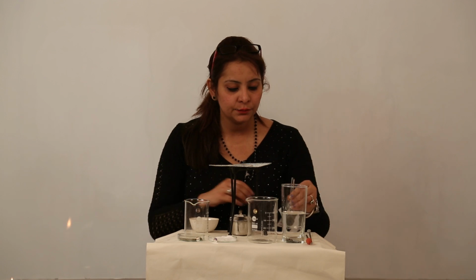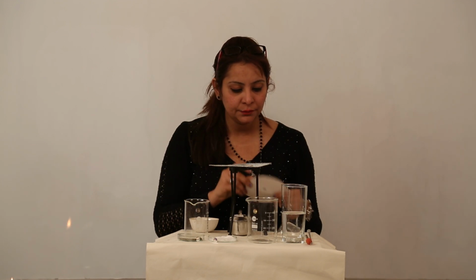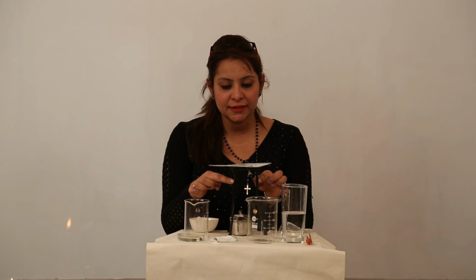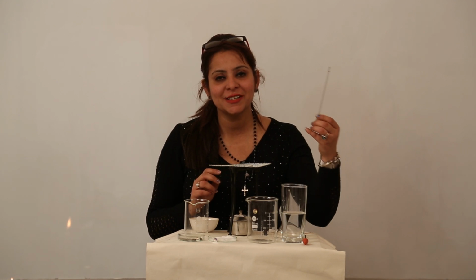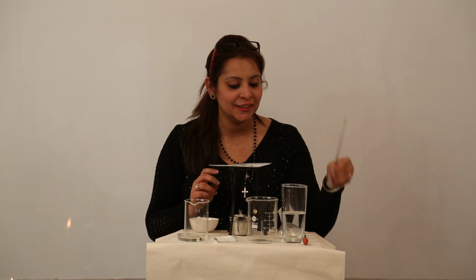This is the funnel, a filter paper, a tripod stand, a wire gauze and a burner. And of course a stirrer, how can I forget, because we need this to mix anything. So this is the whole apparatus we need to carry out the demonstration of separating the mixture of two solids.